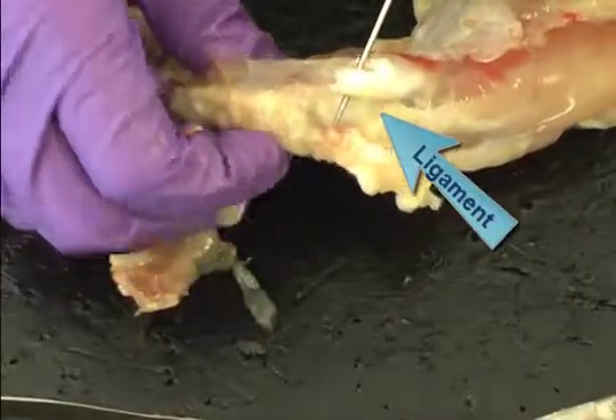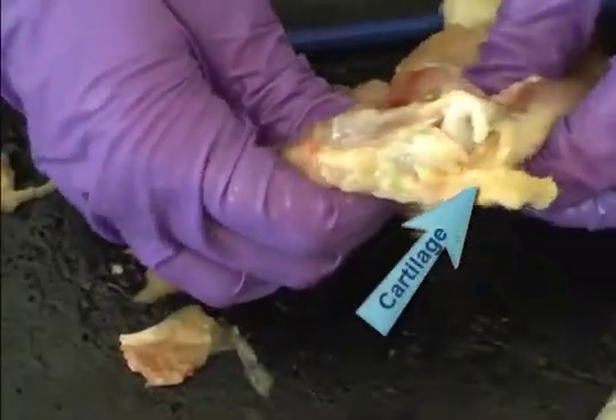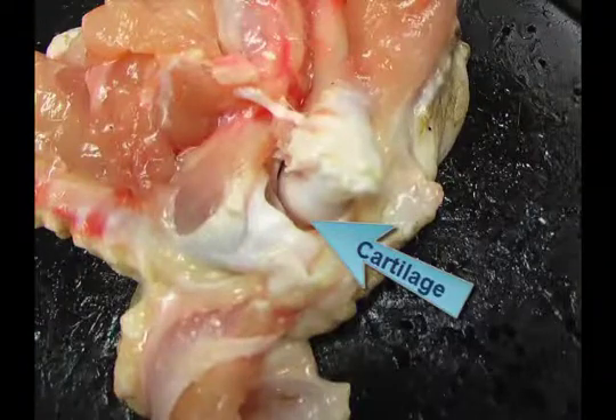Ligaments are tough, white, cord-like structures that connect one bone to another at the end of the bones. Examine the ends of the bones and look at the white, shiny covering of the cartilage at the joints. Cartilage reduces friction and protects the ends of the bones when the joint moves.